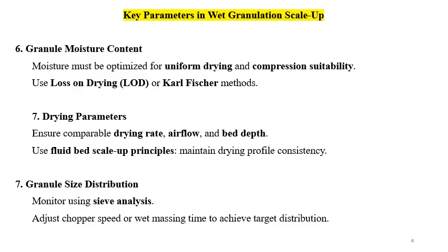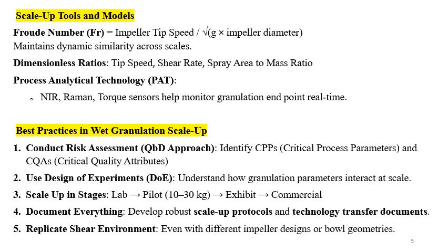Over drying also may lead to capping tendency in the tablet formulation. Granule size distribution: monitor using sieve analysis. Adjust the chopper speed or wet massing time to achieve the target distribution. So binder addition time, binder addition rate, impeller speed, granulation time, chopper speed, and kneading time become very important.